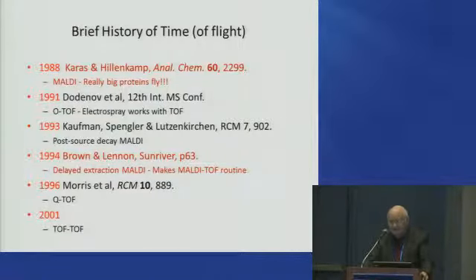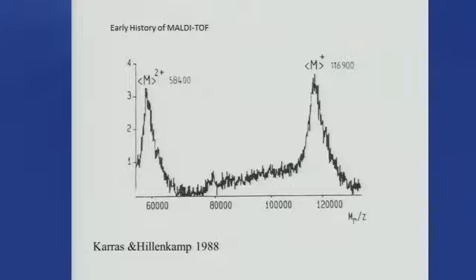But it took these guys to take a new look at it and say, if you pulse the extraction, you can do some things that you can't do with continuous extraction. And so there's the QTOF and the TOF-TOF, which have come along more recently, and I'll touch a little bit on those, but I won't have time to go into detail. A lot of this stuff is now commercially available.